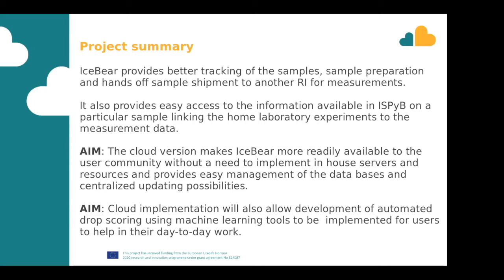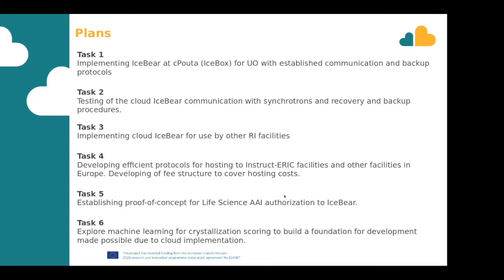So the goal was to provide also an easy management of the databases by centralizing this setup so that it's all in the cloud. And this cloud environment would also allow us then to build on top of that different features, because we have a lot of data coming from the users, manually scoring and the experiments and so on, to enable tools to facilitate the actual work done in the laboratory by building this automated drop scoring and so on. That is still to be implemented, I think, but we have some plans towards that now. But this is what the cloud environment actually would enable us to do.